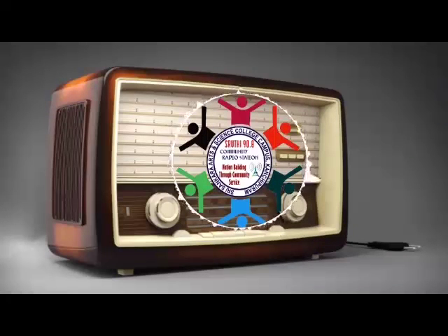Next thing is the impeller, which is used for proper mixing of components inside the bioreactor. There are four types of agitator or impeller used. With the help of mixing, we can achieve bulk fluid and gas phase mixing, air dispersion, oxygen transfer, heat transfer, suspension of solid particles inside the bioreactor, and maintenance of a uniform environment throughout the vessel.